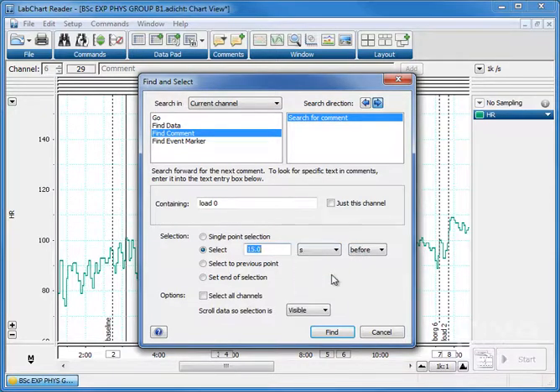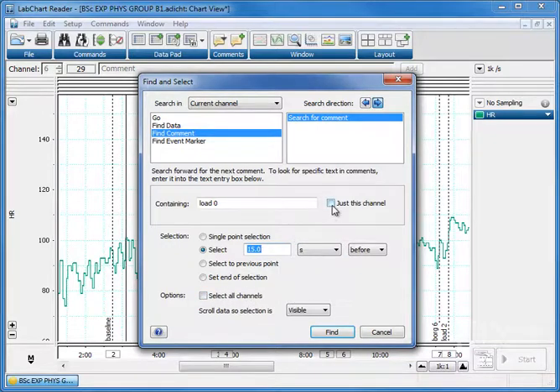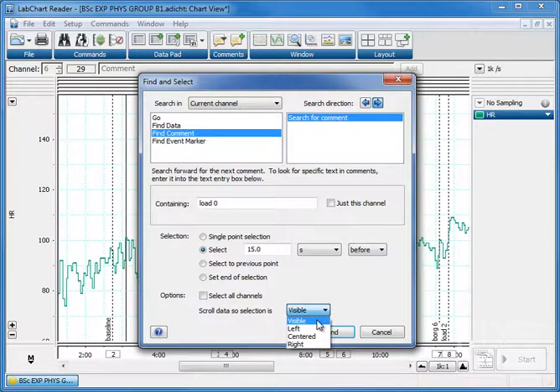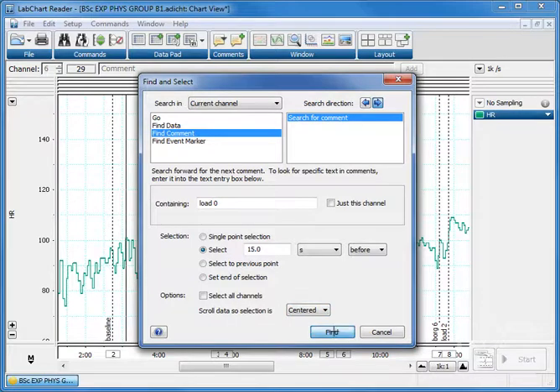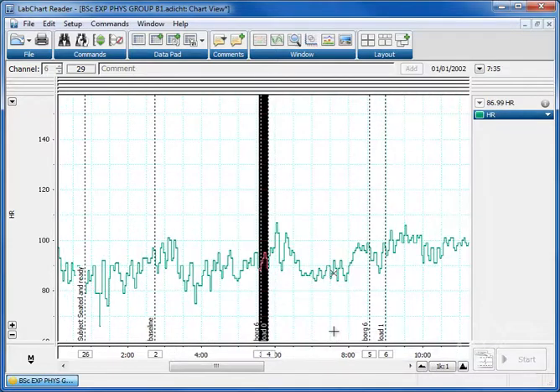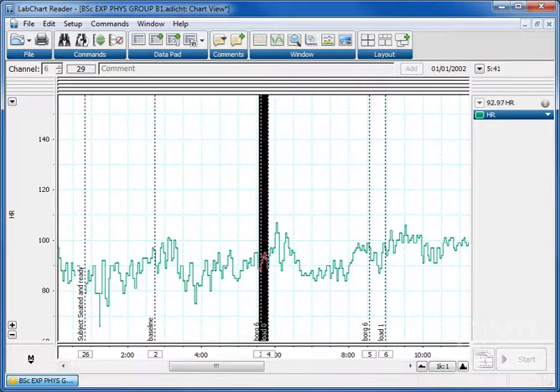We're going to select not all channels, just this channel, and we're going to scroll it so that it is in the center of the view. So we click find. And there we are. It's found the word load naught and it's selected the 15 seconds prior to this.